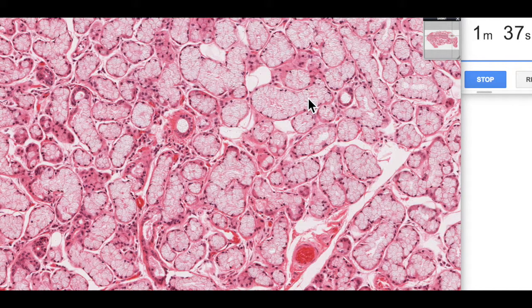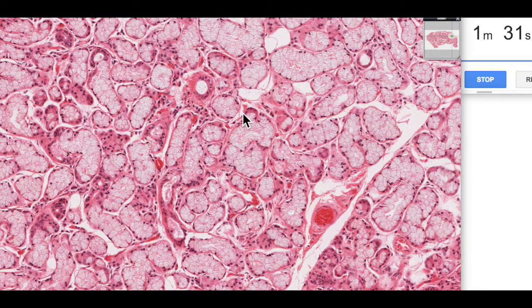Now if there is a serous component associated with these mucus acini, they often appear as these sort of little serous demilunes, little caps of serous cells which sit on the surface. And this is a little bit of artifact. When these cells have been processed, the mucus has sort of expanded and squeezed out the serous cells onto the surface of these mucus acini.